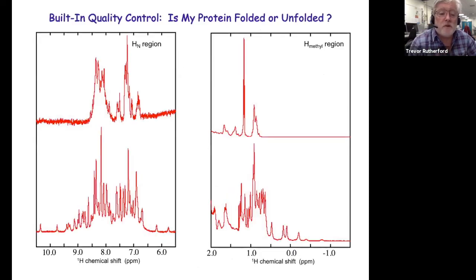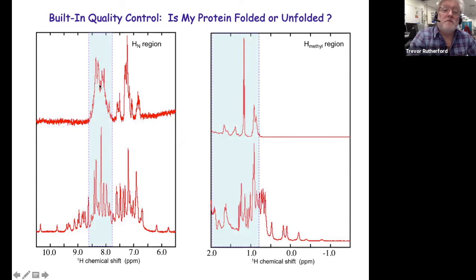One of the things I would put across to people is the idea that protein NMR, by observing the protein itself, has a built-in advantage that you can always see if the protein's gone off. So you have this built-in quality control check. Is your protein folded or unfolded? Well, you'd see it instantly, okay? And if during the experiment, the protein goes off and you're no longer working with viable protein, you'd see it. Basically, in this case, all of the signals from an unfolded protein will be exposed in the same solvated environment in solution. They'll have very uniform environment.